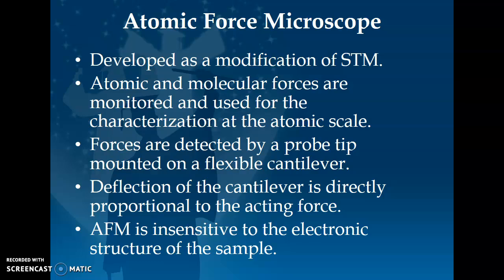We will see the figure, then we will understand how it works. Understood? Deflection of the cantilever is directly proportional to the acting force. As the name says, the deflection of the cantilever is proportional to the force acting, and we will see the working of the microscope.